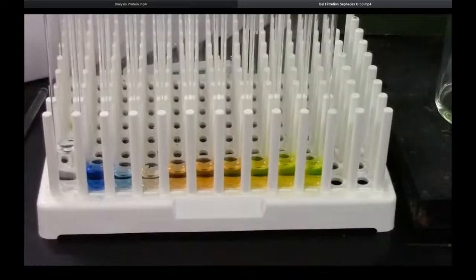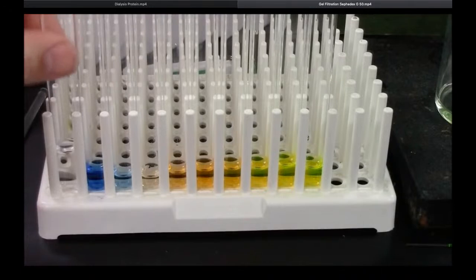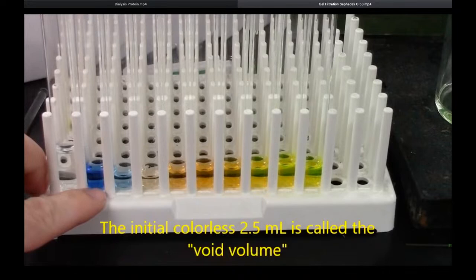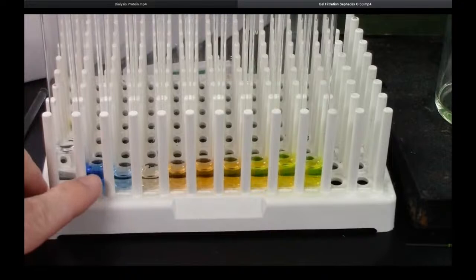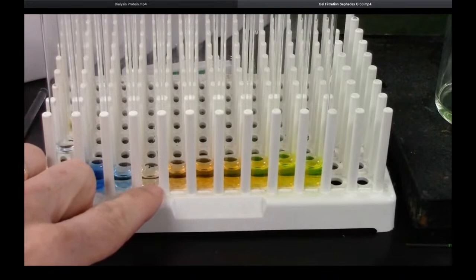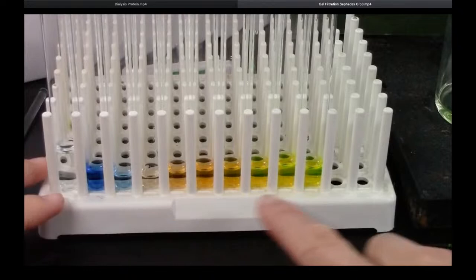Here's the fractionation. This first tube has nothing in it. So this volume, which looks to me about 2.5 milliliters, is called a void volume, where nothing comes out. But then the blue molecules, the blue dextran, came through the column swiftly. So this is about a milliliter. Some of the blue dextran tailed into the next fraction. This is low concentration. Then I have a nearly colorless fraction here, and then the fluorescein starts coming out here. Fluorescein stopped coming out right about here.